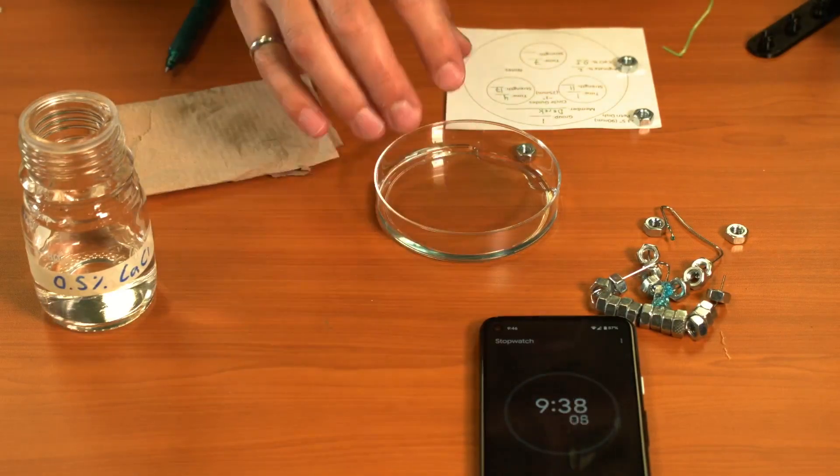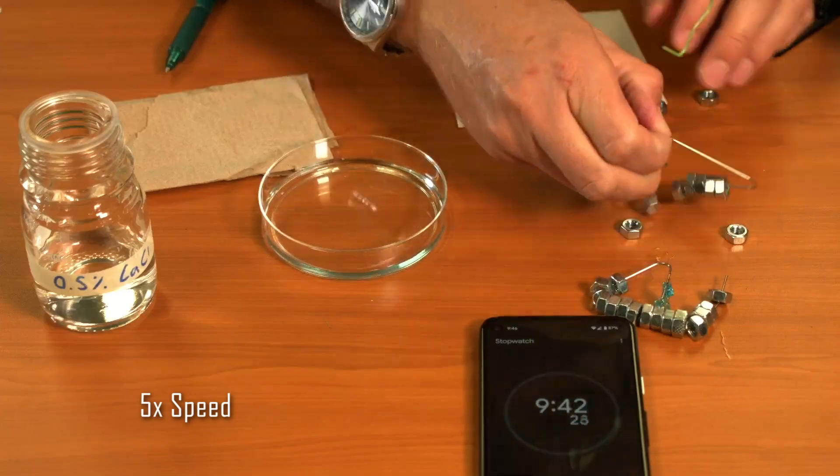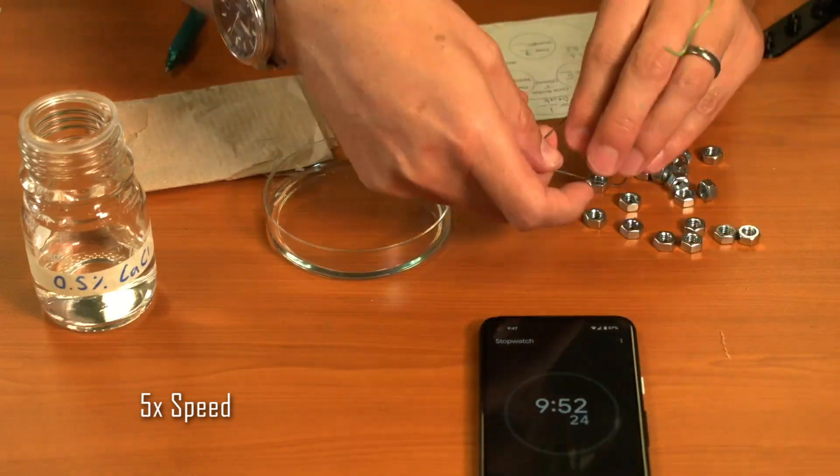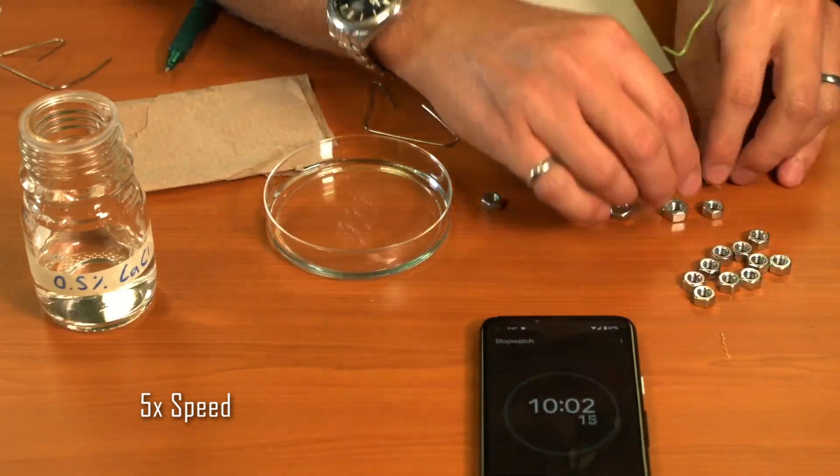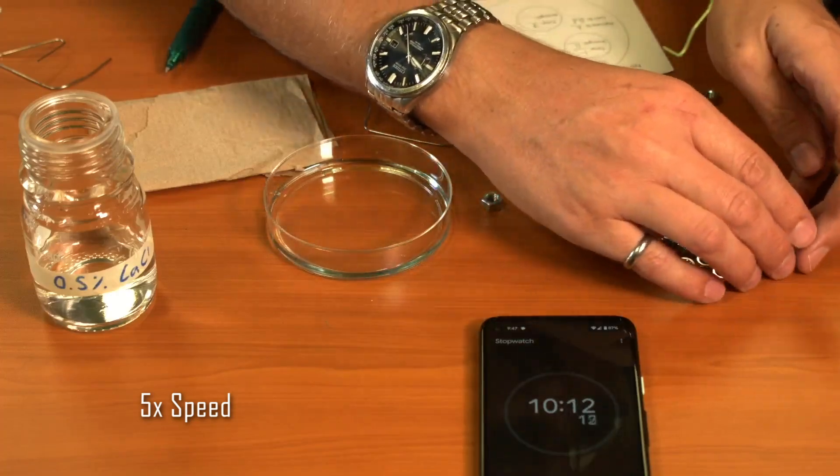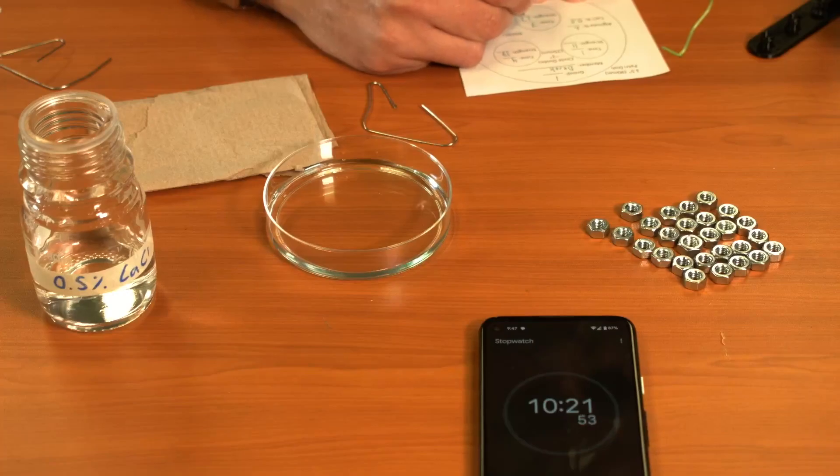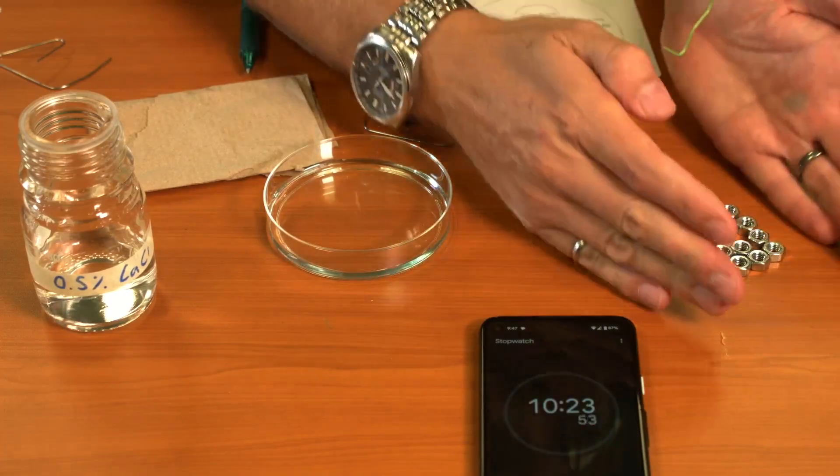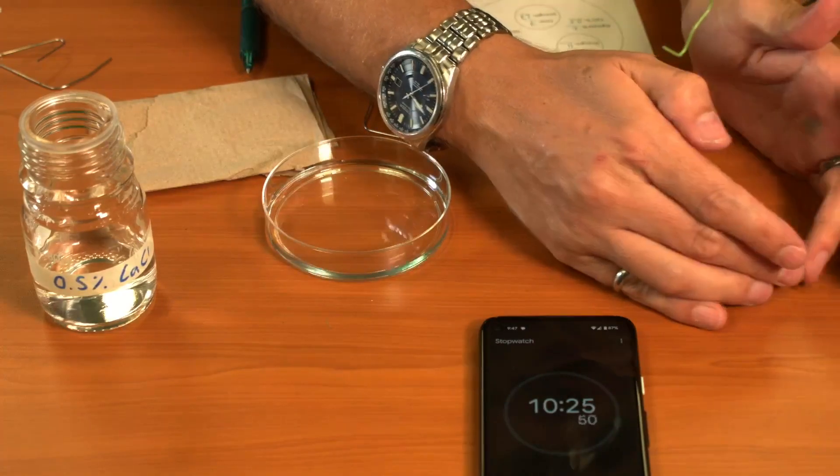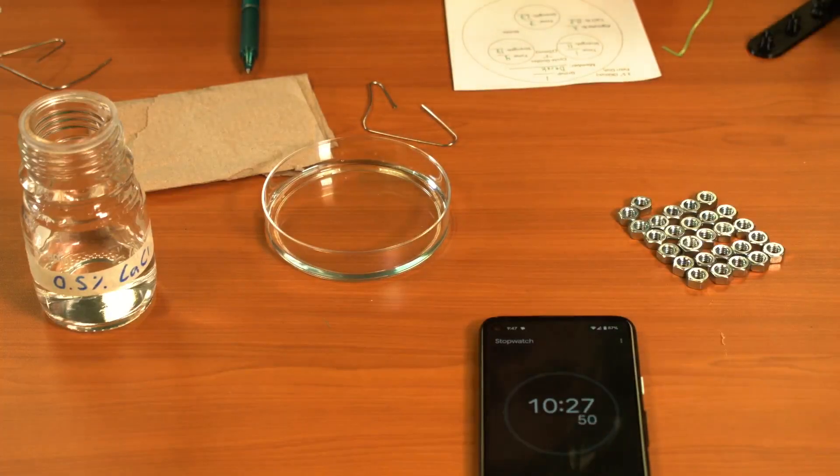Alright, let's count those out. 27. So we can see that from this one we were obviously able to hold more weight as we let the rings cure longer in the calcium chloride. That's because the longer it sits, the more of the sodium alginate is able to be cross-linked.